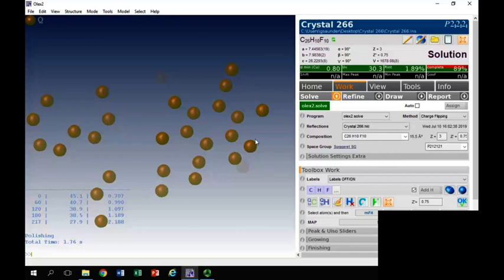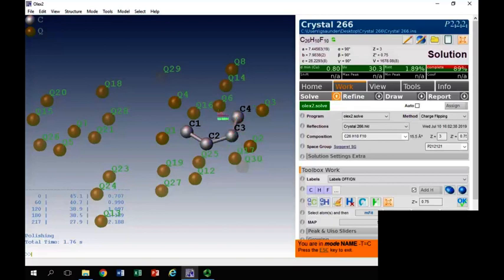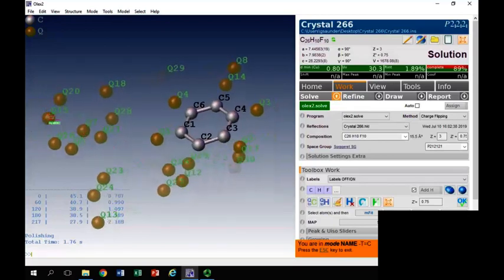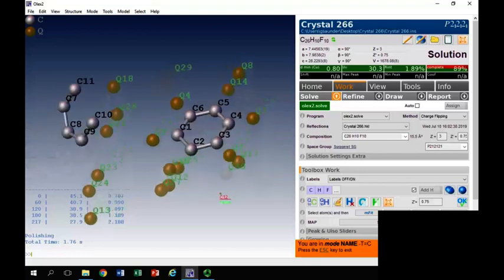Q means anything, it's just electron density, to various atoms. If that's benzene, then we've got 6 of them joined up. This looks like the beginning of a benzene as well. We're missing one, but that may turn up later.